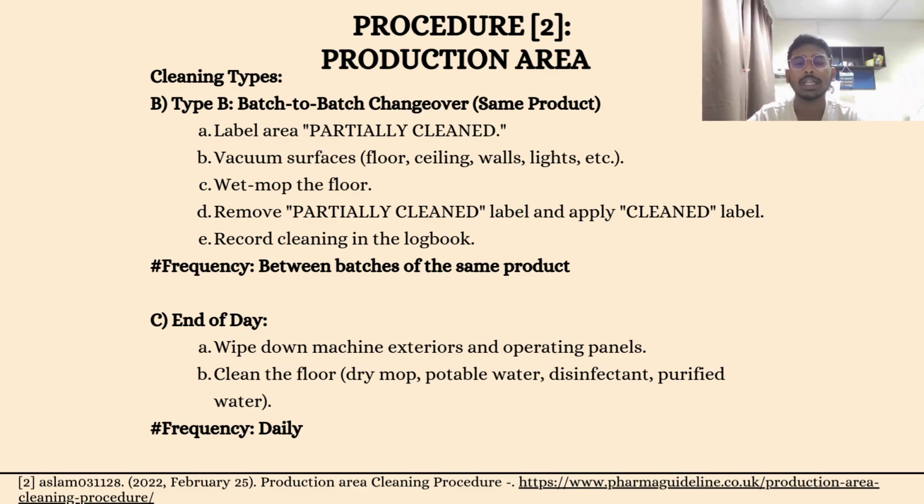And finally, the last one is end of the day cleaning, where we wipe down the machine exterior and operating panel, and clean the floor with a dry mop, potable water, disinfectant, or purified water. And usually we do it on a daily basis.